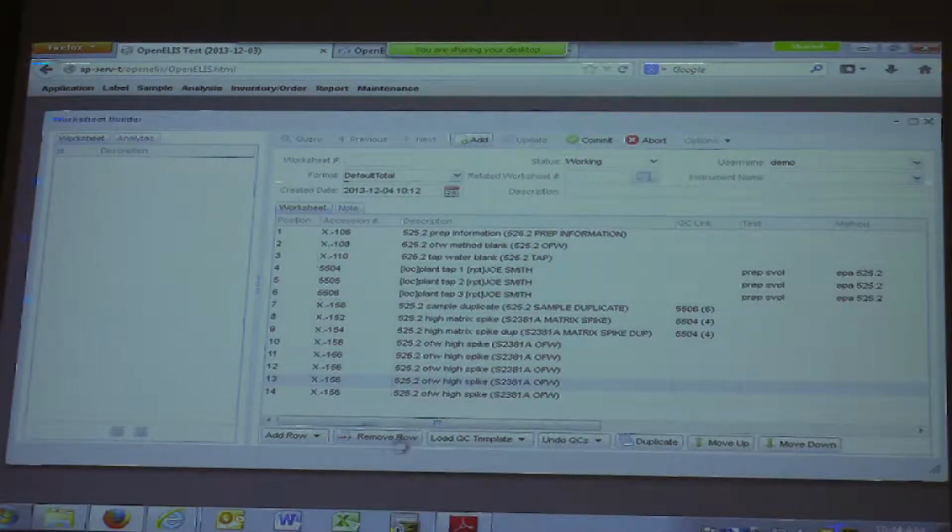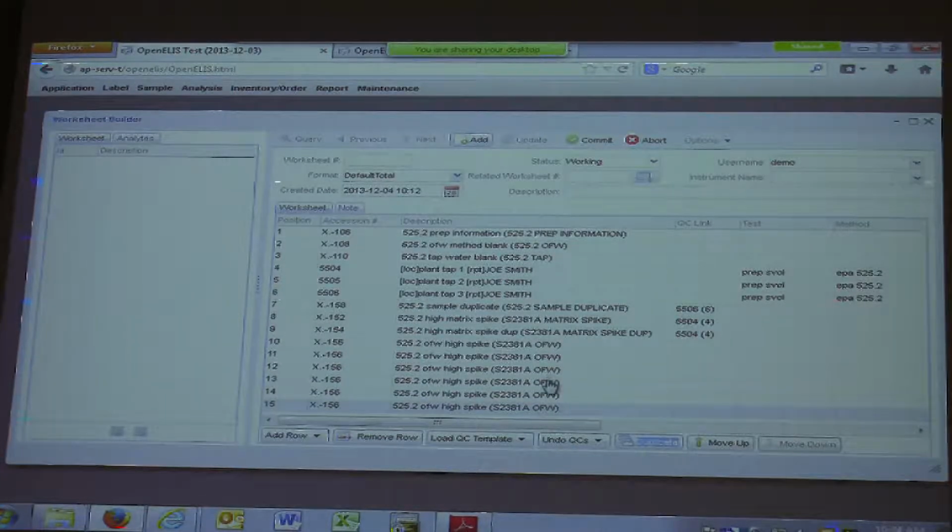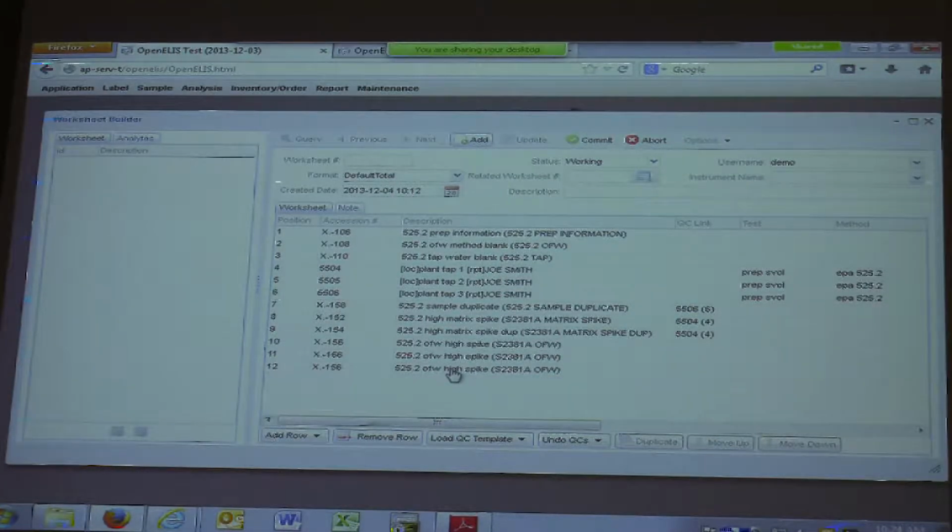Remove row, however, you can only do one at a time. I can reselect it. You can do multiple. You already did that. You showed it. Sorry, yeah, that's right. You can remove multiple. I think what I meant was you have to re-highlight there to select another. Yeah, if you're doing one at a time, yes. So if I do this, I can remove a group, remove all those, but now I have to reselect it again.